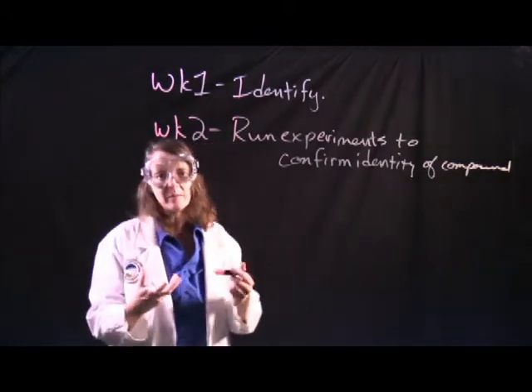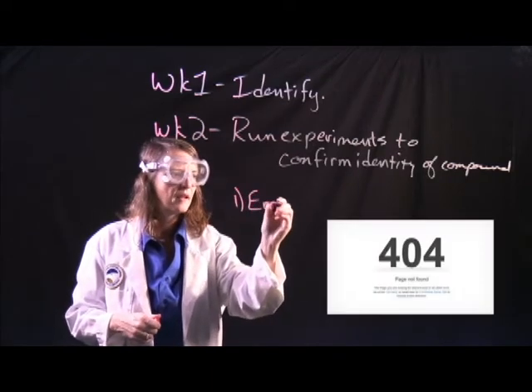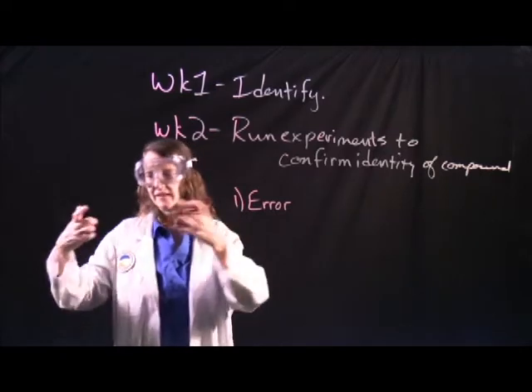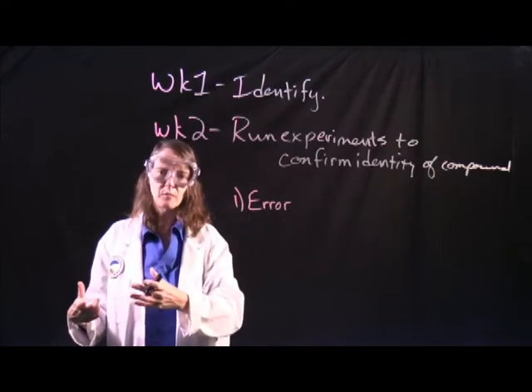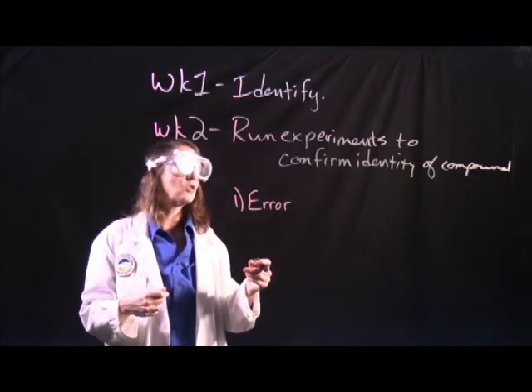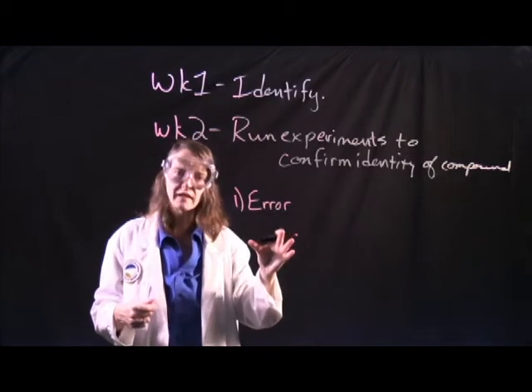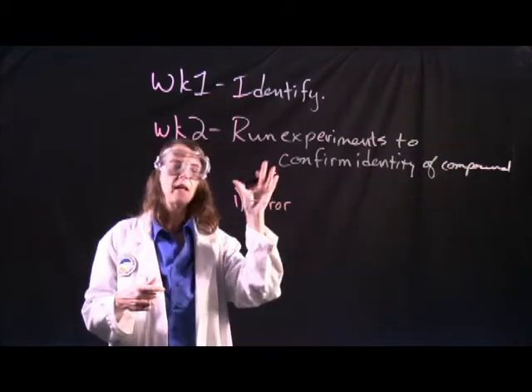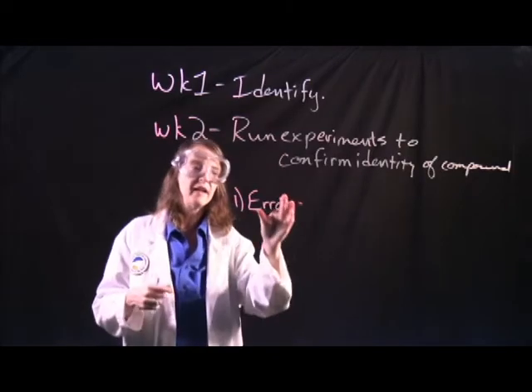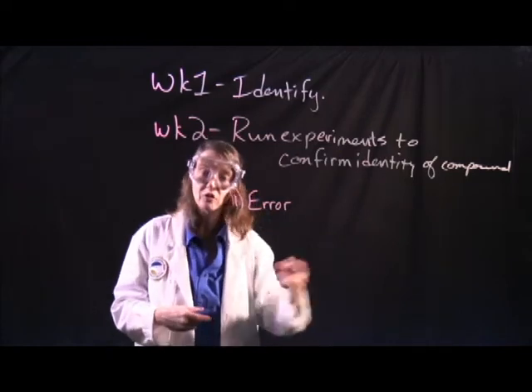One, there's quite a bit of error when we do this experiment, and that's to be expected, given the fact that we're using LabQuest probes and general chemistry environment to make some of these measurements. So, for example, with the solubility, you might not measure exactly what you find in literature. That's okay. The point is I want you to look at the literature value and compare what you measure. If there is error, that's fine. You can discuss sources of error in your lab report.